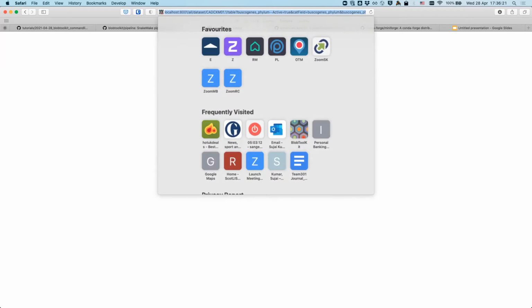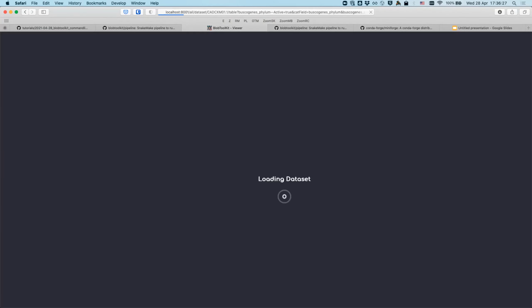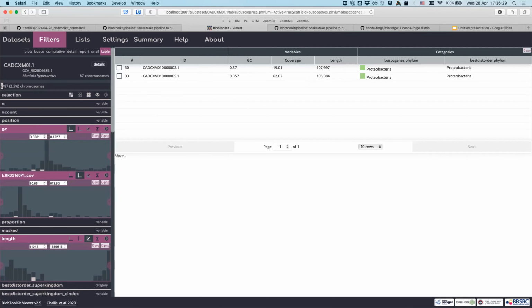Oops, have I broken something? I think I've broken something. Oh, that's embarrassing. Right, we can't do that. Sorry, I don't know what I've done. Maybe it's opened a separate, no. Okay, we can't do that. Sorry, the main browser works, but the little pop-up is not working. I'm really not sure why. I will check that. Sorry, my bad.